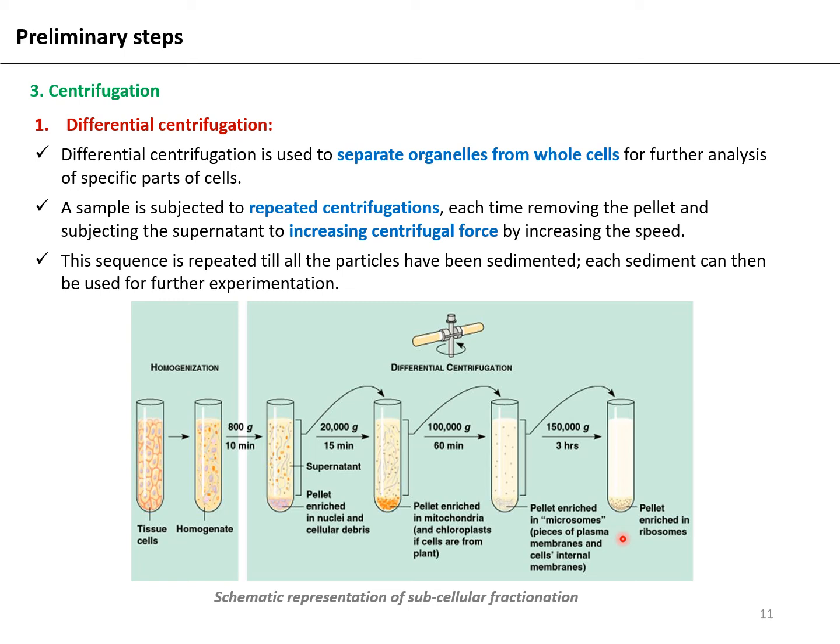So this process is also referred to as subcellular fractionation, because you're fractionating the different cellular components. So you're spinning, collecting the supernatant, spinning it again, collecting the supernatant, and so on and so forth.